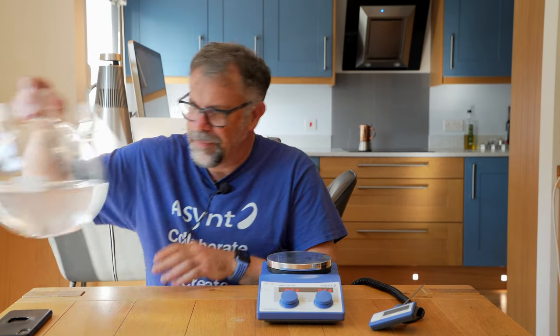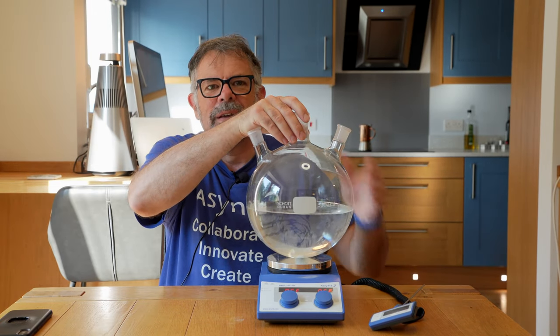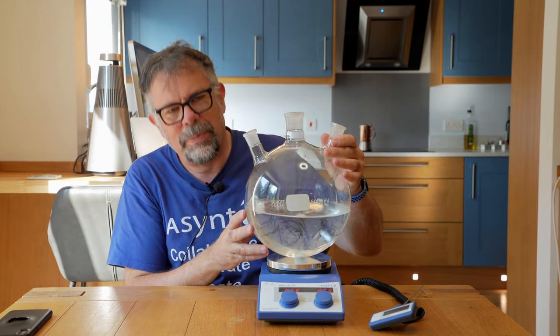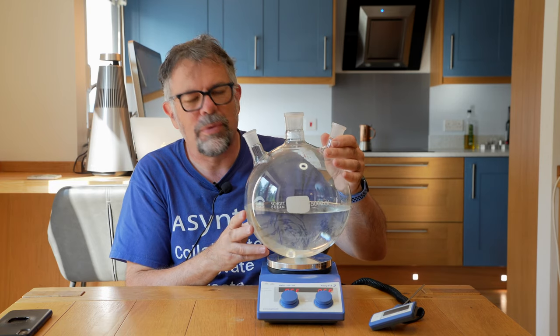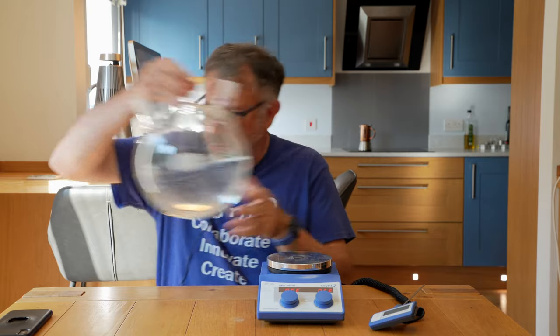That's what it is — oh yes, it's quite big isn't it. Oil bath on top: not very sensible. Heating mantle with hot spots: not brilliant. We have the solution.